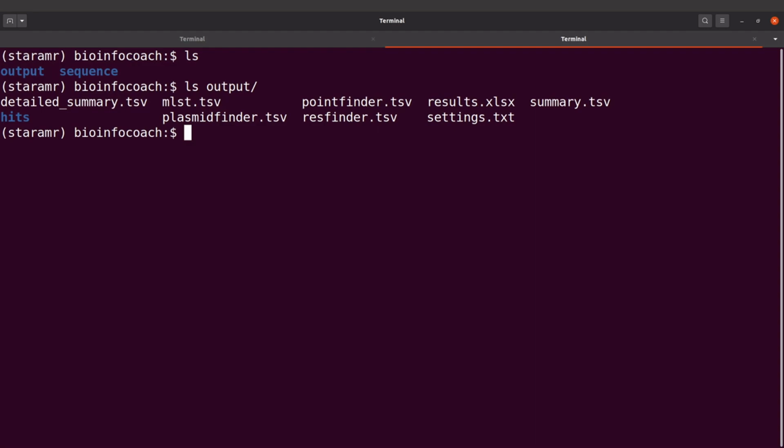So we are going to explore it. If you want quick information, a quick overview, then you just have to explore that, and that is why we are going to start with it. It has been given to us as .tsv, which means it's a tab separated file. First of all, this file can be opened using spreadsheet software. Let me open it for you to see.